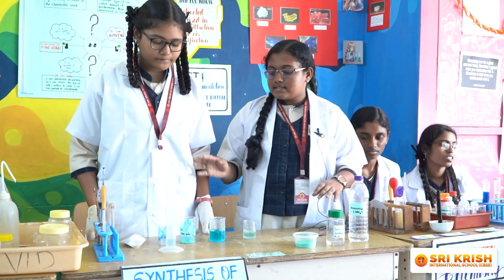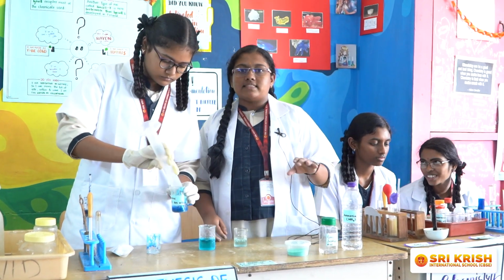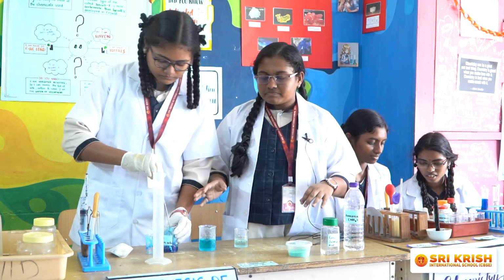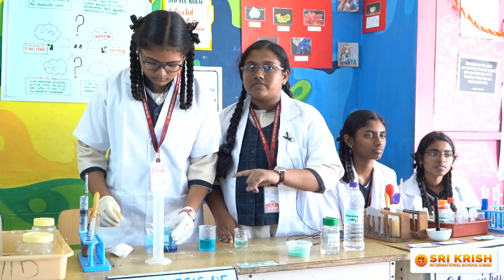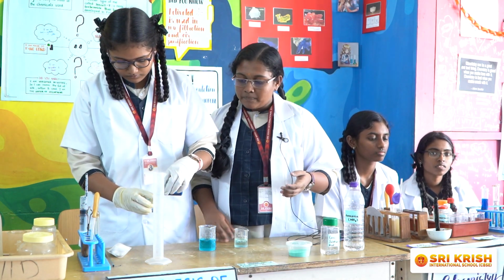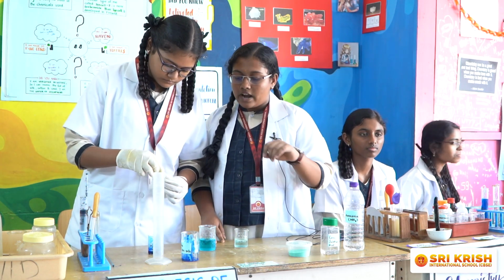For this synthesis, initially we take copper carbonate and add it with ammonia. It gives a blue color solution, that is tetraammine copper(II) ion solution. As the copper carbonate does not dissolve completely in ammonia, we filter and transfer it into another beaker, and we require a natural source for the synthesis. So we are taking cotton wool and dissolving it in it.